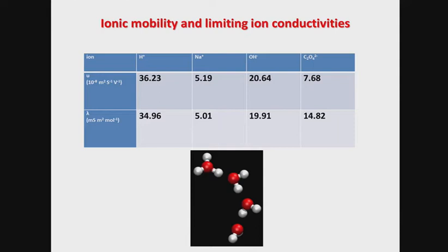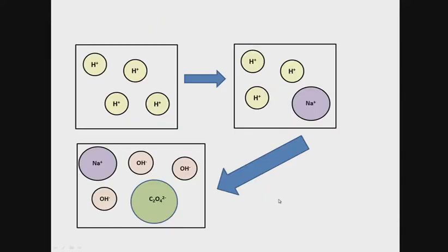Now, the next question is, how do we connect these sets of data to the observation that we have made in this experiment? So, let us have a look at the cartoon of the titration mixture. This is what you start with: there is an excess of H plus ions and then you are adding OH minus ions in the medium.